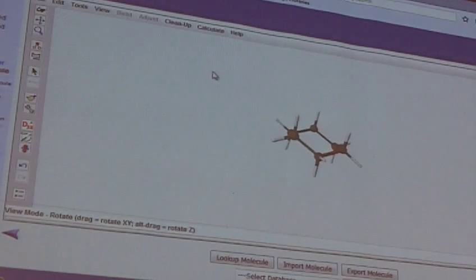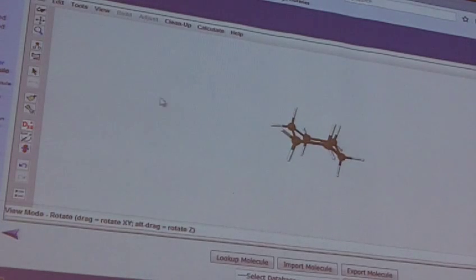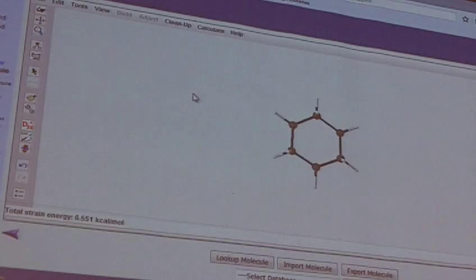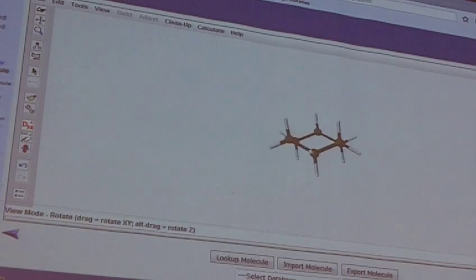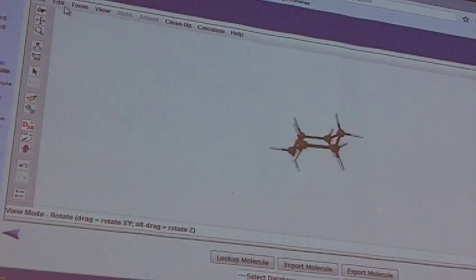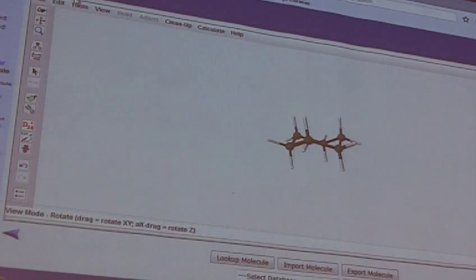And that should be an energy minimum, right, to be existing as a chair, but we could click the wrench again, see what we get. Sure enough, we end up with a chair, okay? Now what you've got to be careful with the other ring conformations, besides the chair, if something is an energy maximum and you hit it to minimize it, it's going to minimize it to the other conformation that's lower than it in energy, okay?